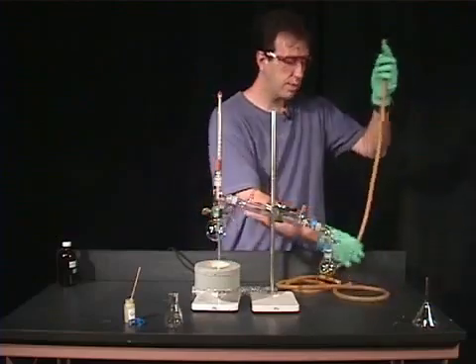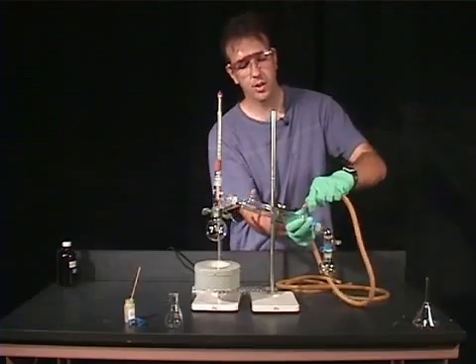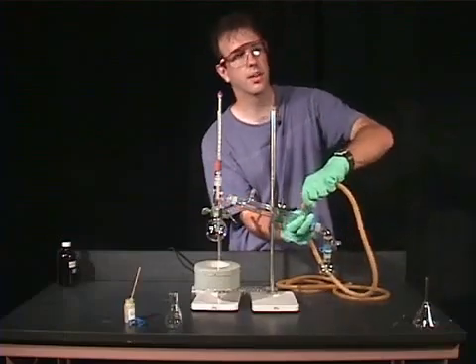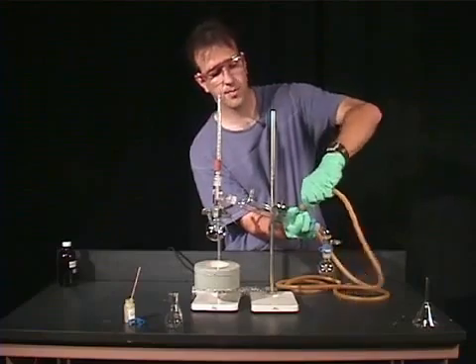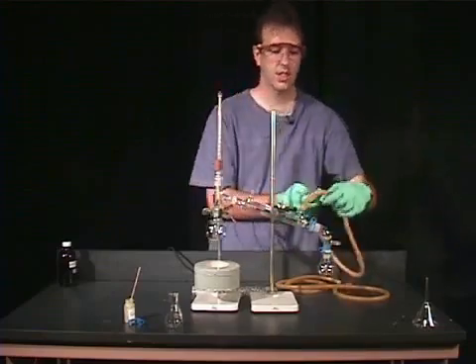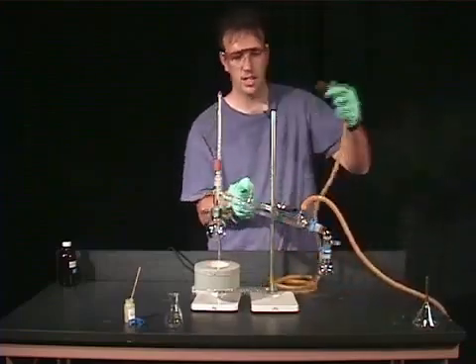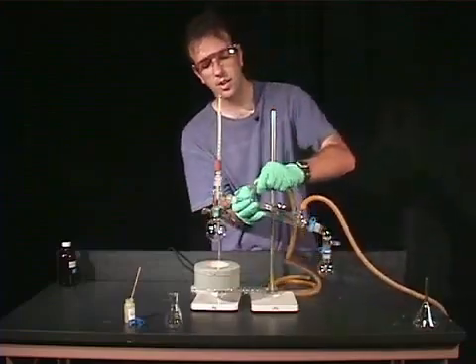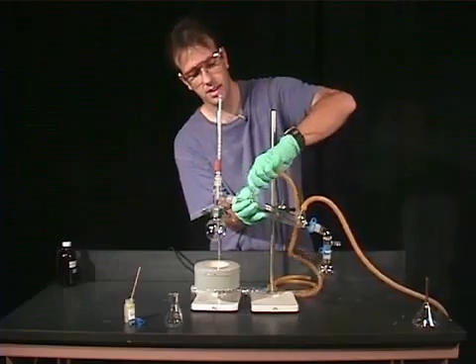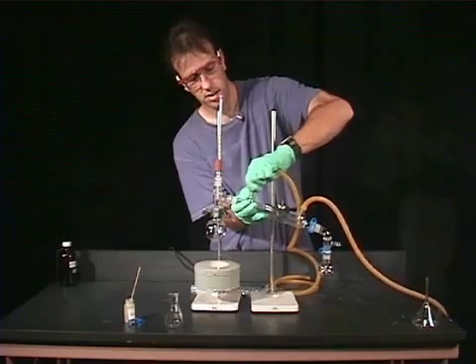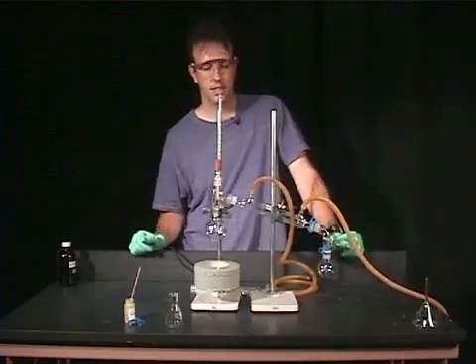Now we want to add the rubber tubing which will be available in your hood. The water goes in at the bottom. You can always get the tubing just a little bit wet and it will help it slide onto the water jacketed condenser. And the tubing that goes to the drain comes out the top.